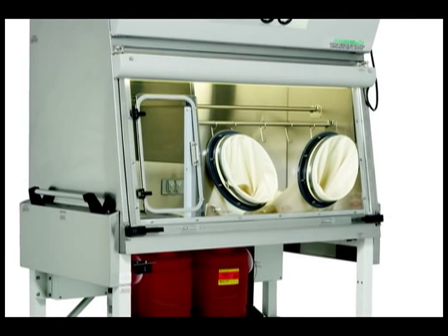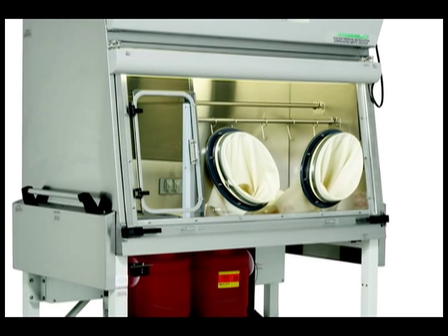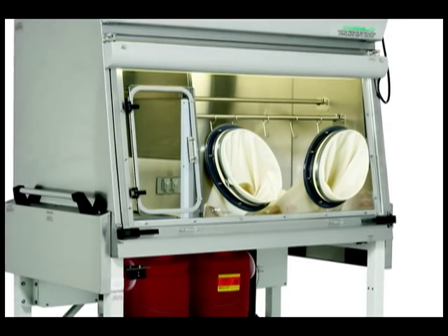The gloves and sleeves of your PharmaGuard 797 will need to be replaced on a regular basis. NewAir recommends replacing fixed gloves on a daily basis and the sleeves every six months.